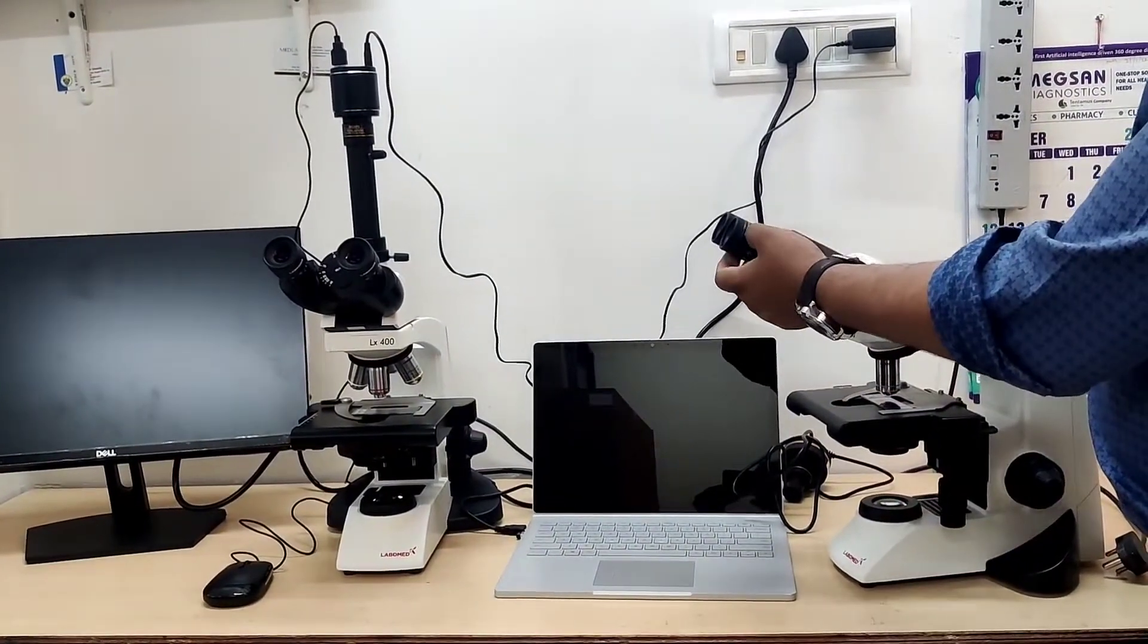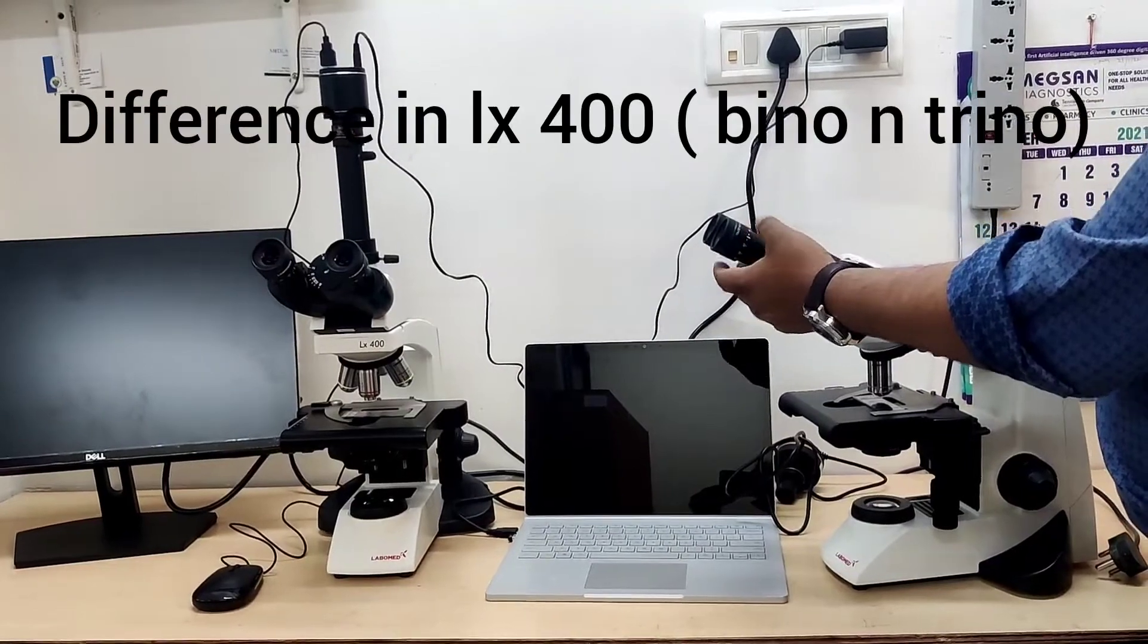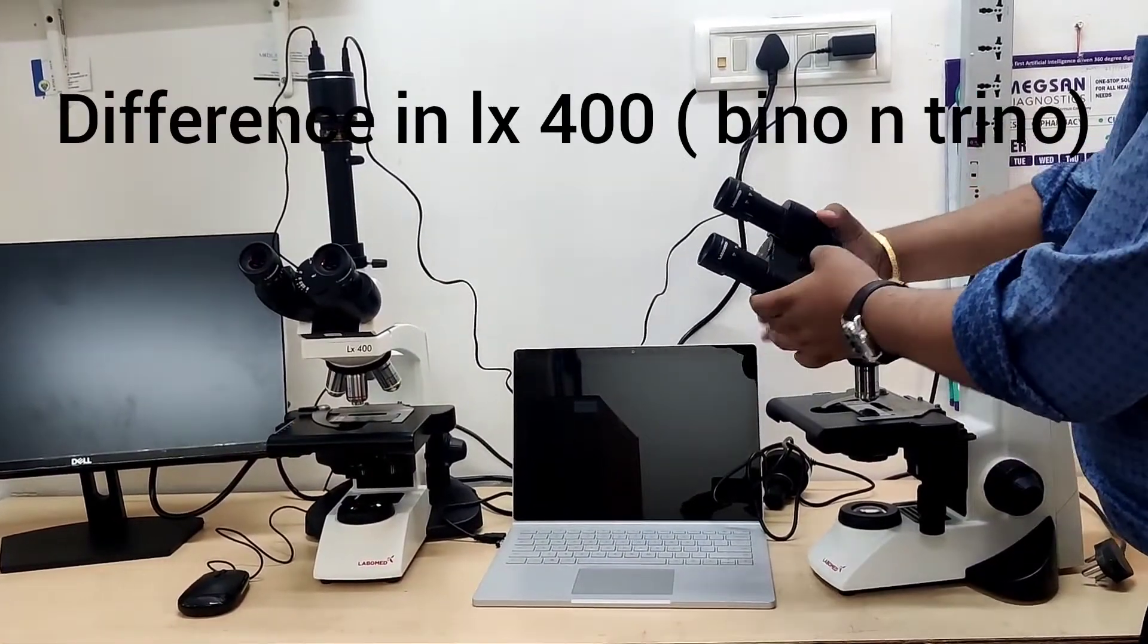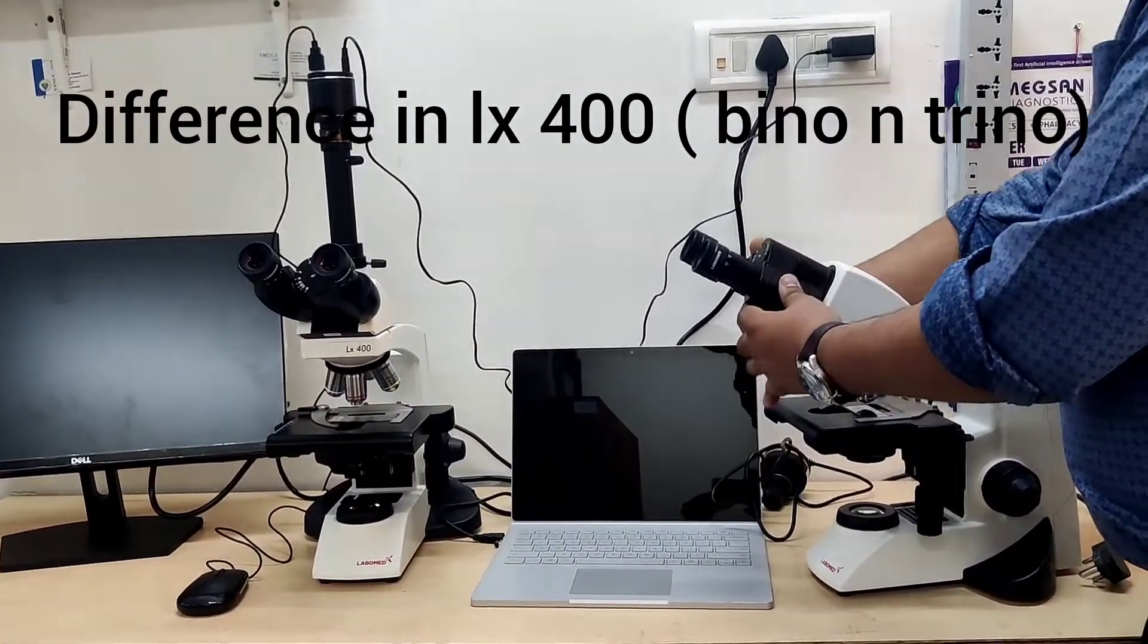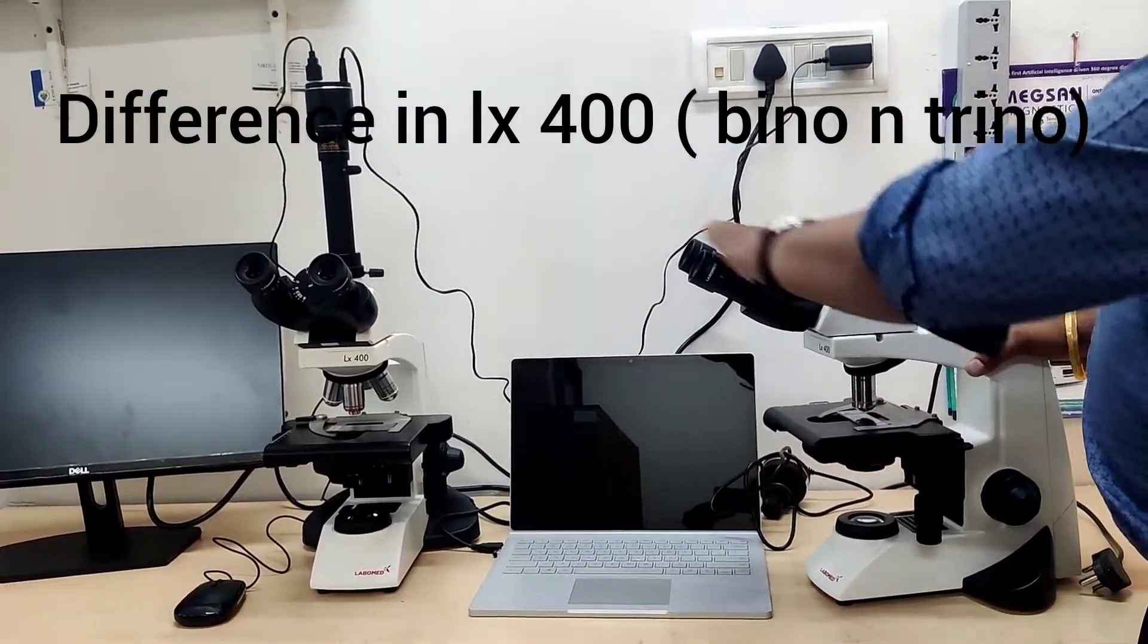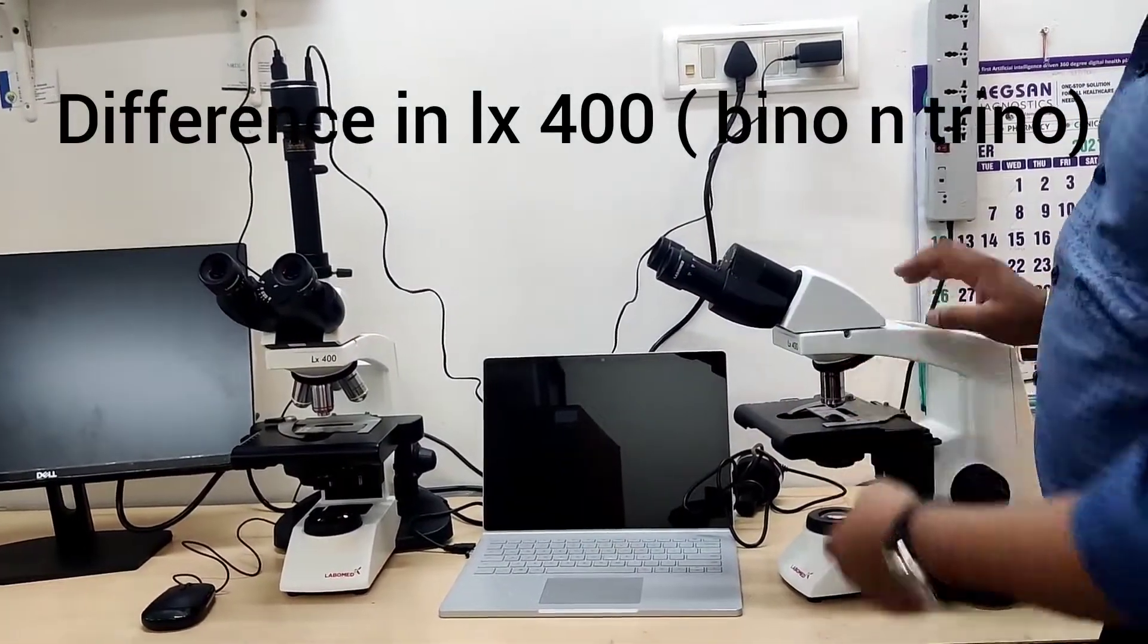In this you are getting 20mm field of view. You are getting butterfly rotatable head. Angle of inclination is 30 degrees. You will be getting 4 objectives.